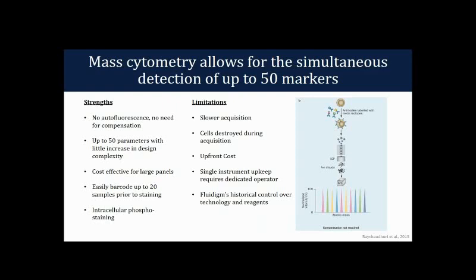You guys don't need to worry too much about single instrument upkeep. That's my job. It's quite a bit of work to keep these things running. As you can imagine, it's a fluidic system hooked up to a mass spec, which is always a lot of fun to take apart and keep operational. And lastly, I do want to comment about the historical control that Fluidigm, who has been very gracious in their assistance with keeping this machine up and running, but also limiting in that they have a lot of control over the technology and reagents themselves. So this is starting to change.